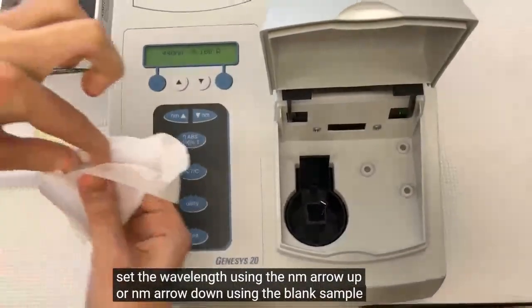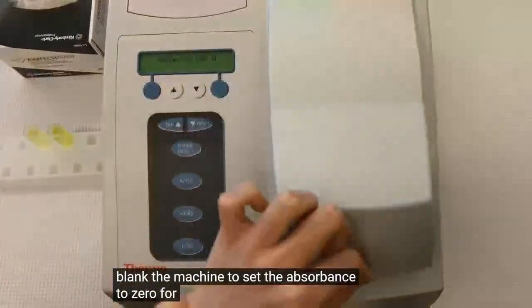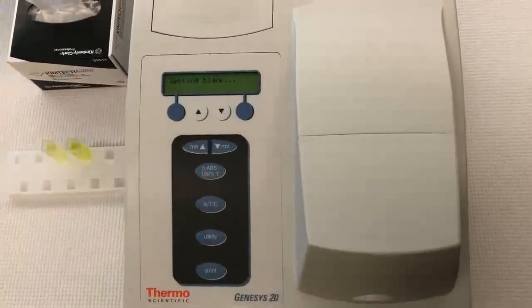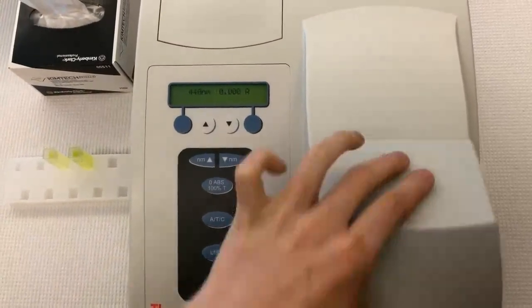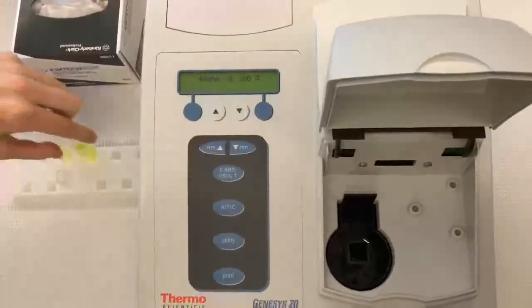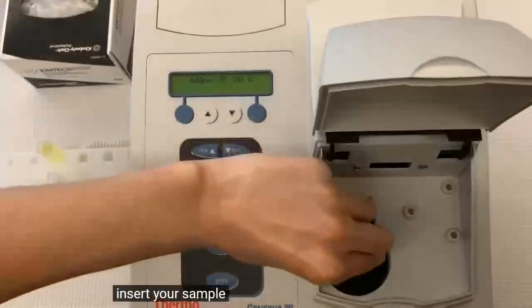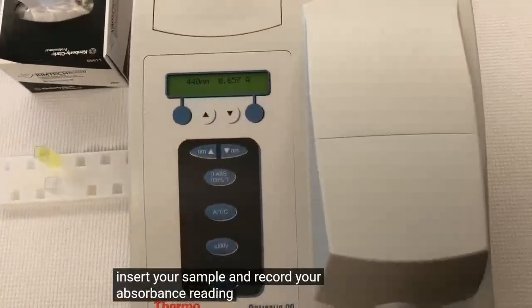Using the blank sample, blank the machine to set the absorbance to 0 for the new wavelength. Remove the blank. Insert your sample and record your absorbance reading.